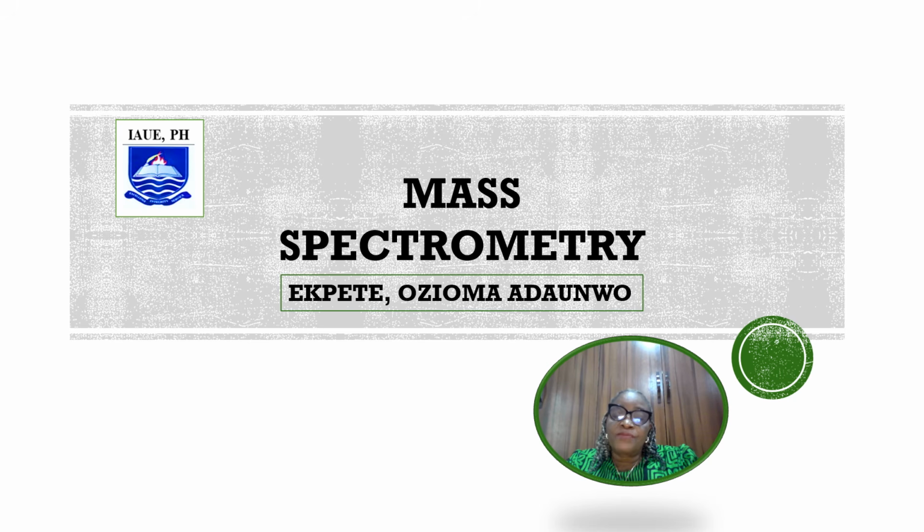It helps identify the amount and type of chemicals present in a sample by measuring the mass to charge ratio and abundance of gas phase ions. It provides information on elemental composition, molecular structure, and quantity, achieved by ionizing a sample, separating the resulting ions in electric and magnetic fields, and detecting them.